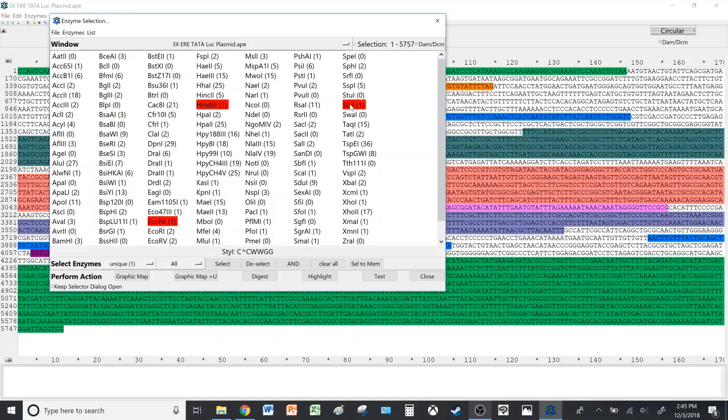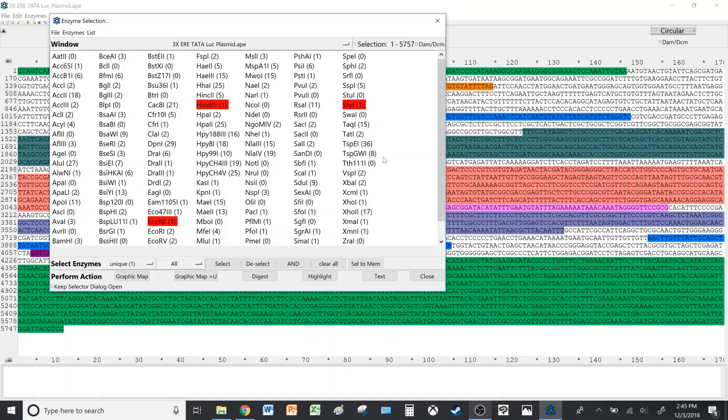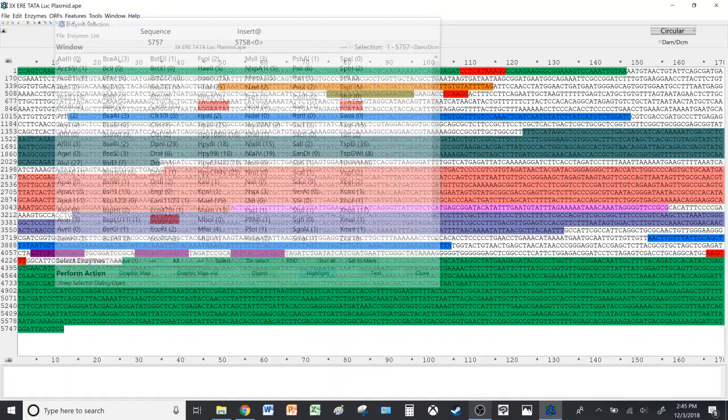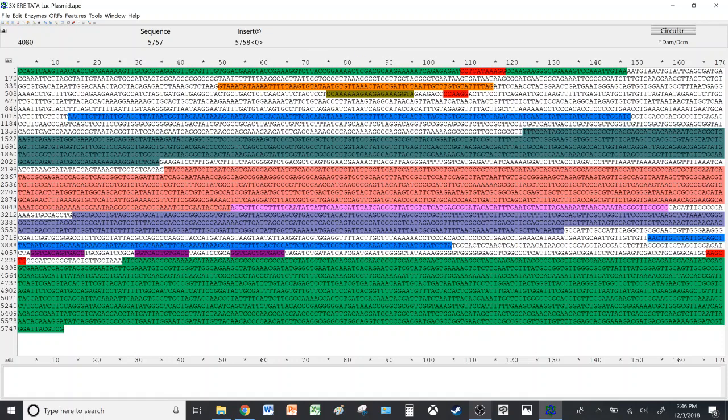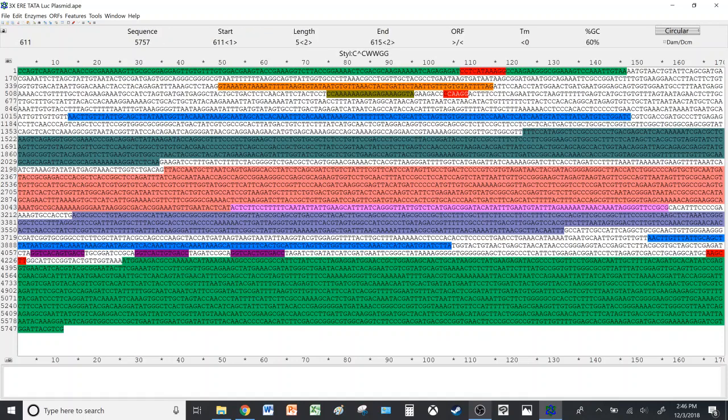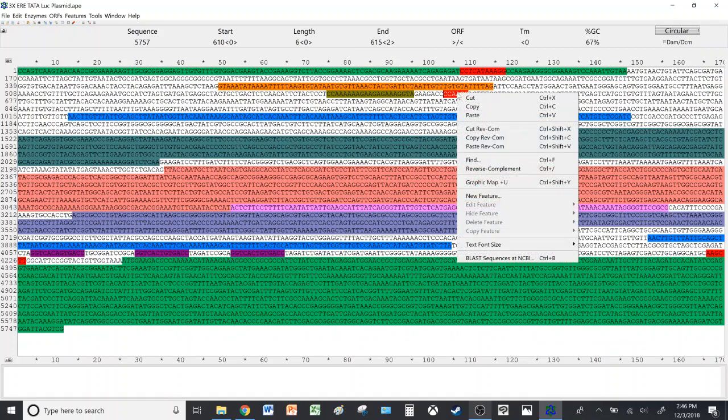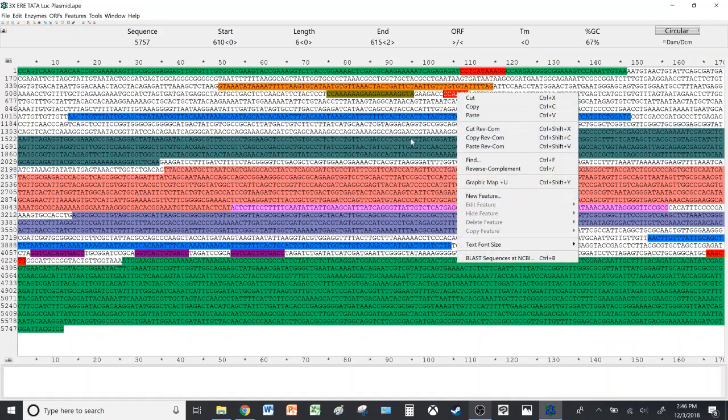And StyI here. Then if you wish for the sequences at which they cut to appear on the plasmid sequence itself, you simply click Highlight and it shows you here. Then you can highlight it or drag your cursor over it and then right click and label it as a feature if you wish. If not, you can keep it highlighted in red like so.